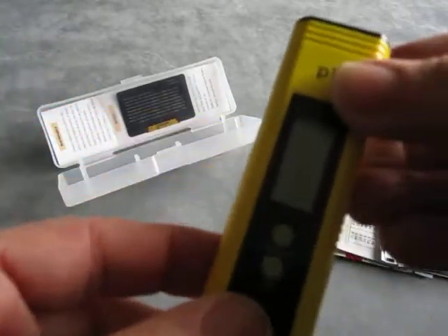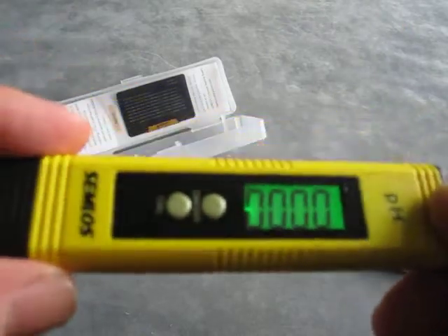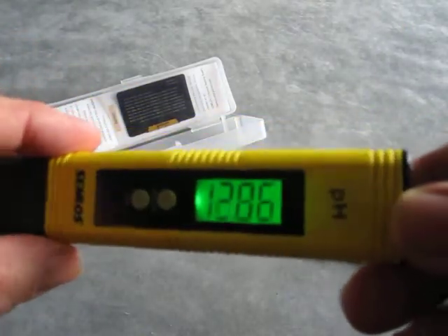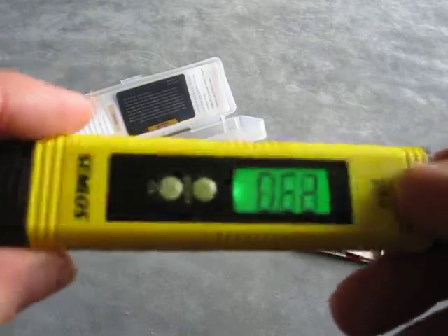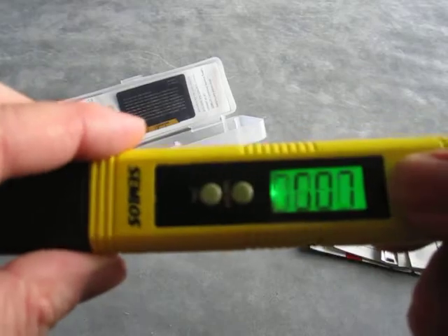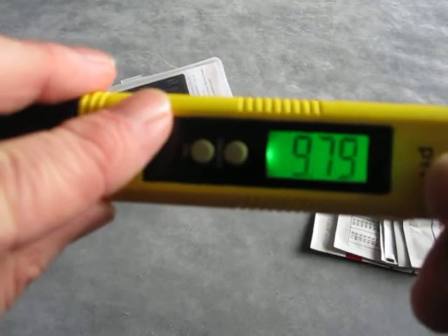We've also got two buttons here: a calibration button and the main power button. Pressing the power button, as you can see, the display is backlit, giving a nice clear reading. It's not in any fluid at the minute, so it's not giving a correct reading.